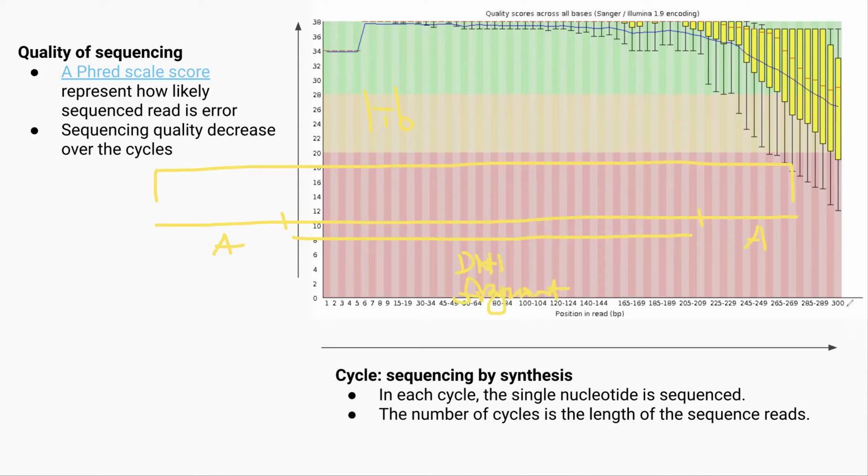Right. And if you do the 300 base pair cycles to know the base pairs, we call these reads, right? Where the reads are located, reads here, reads here. Think about the priming station, right? You bind to the priming station here, then you read out here. So you read out 300 base pairs. It's actually longer than that here. And this one, right? So if you bind to here, then you read out 300 base pairs here. Okay, so let's assume that you read out from here to here.